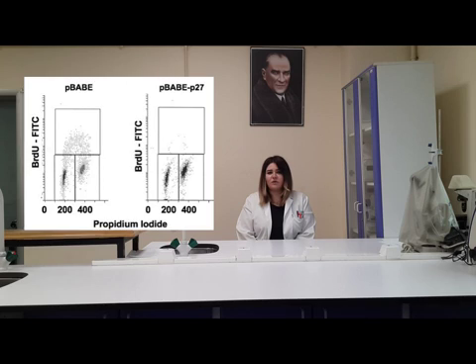One limitation of these types of flow cytometry approaches is that they are only able to establish relative abundance of cell cycle phases compared to one another. For this reason, it is ambiguous if expression of p27 in this figure truly induces an arrest in G1 and G2M, or if it just slows progression through these phases relative to S phase.